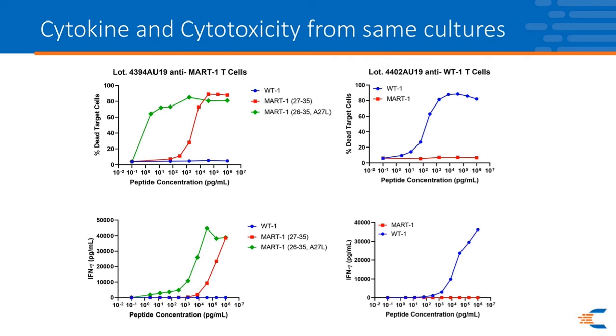The same is true when you look at our WT1 T cells. Yes, they produce interferon gamma in the presence of peptide. But when you use that same peptide and you look at the lysis of those target cells, it's apparent at much lower peptide concentrations. So this is kind of two pluses in one package for us. Yes, it's nice to see interferon gamma. We know this is a pro-inflammatory cytokine, so these tumor-specific T cells would presumably be great in killing tumor. But it's comforting, to say the least, to see that they are able to kill a target cell at a relatively low antigen concentration.